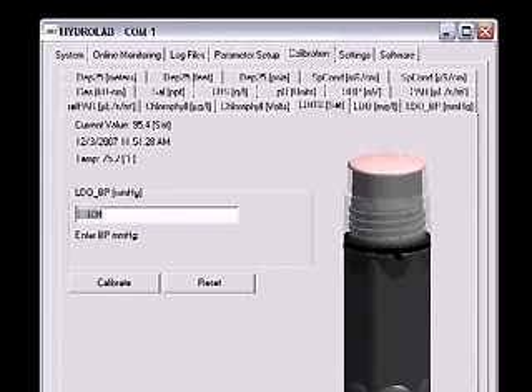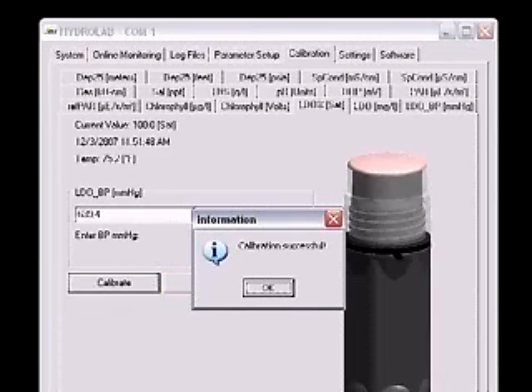Wait for the current value and temperature readings to stabilize. If the cap was stored wet, this should happen very quickly. A dry cap may take several minutes to stabilize. Enter the current absolute barometric pressure in millimeters of mercury in the box. Click Calibrate. A calibration successful message will be displayed.